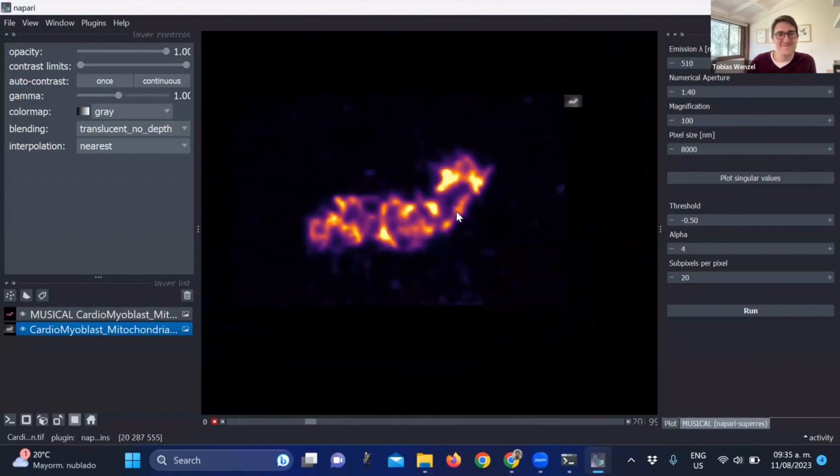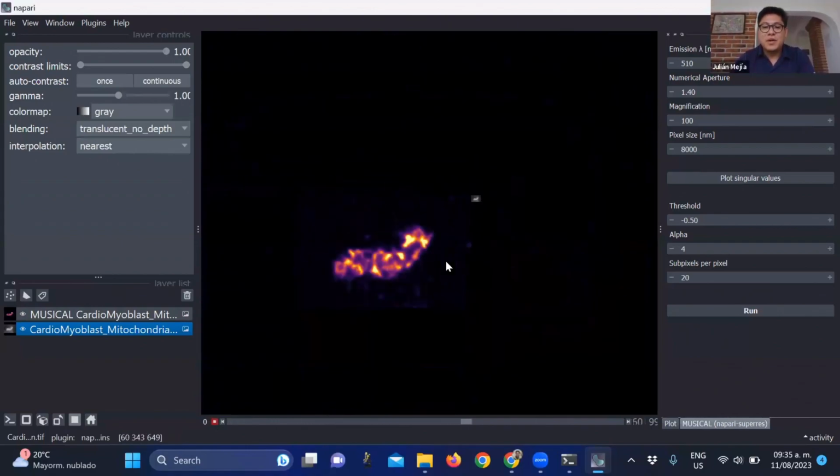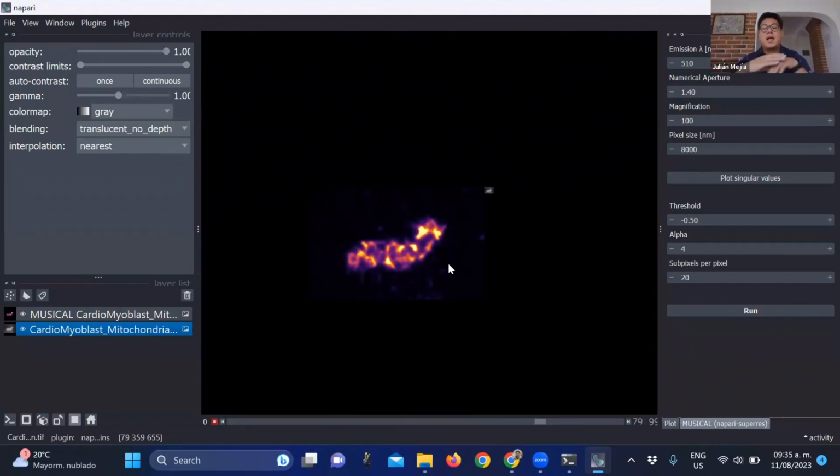Thanks for the clarification. I don't want people to think that the result is a video. This is really important to stress. The result of all the image processing that we are doing is never a video. It's one single image, because you are doing a statistical integration, and then you have one single image as a result with all the information put together in that image.